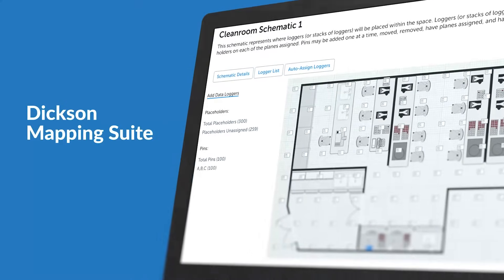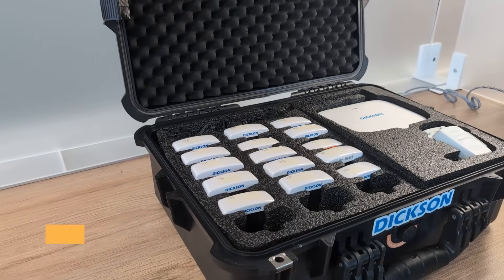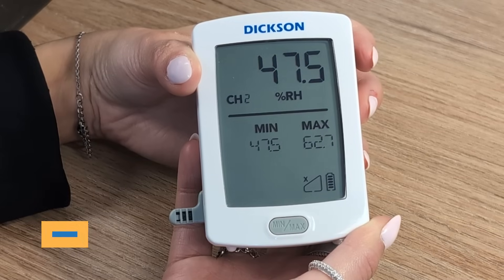Thermal mapping your spaces and chambers doesn't have to be a headache. With Dixon Mapping Suite, you can streamline your entire workflow in just a few simple steps. Step 1: Power up the loggers. Each data logger in your kit is pre-programmed and ready to go. No complicated setup — just turn them on.